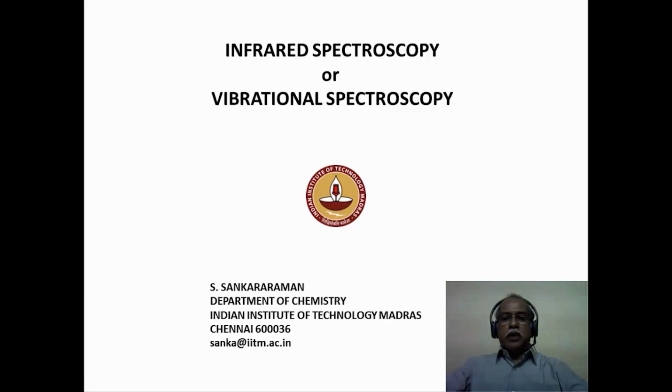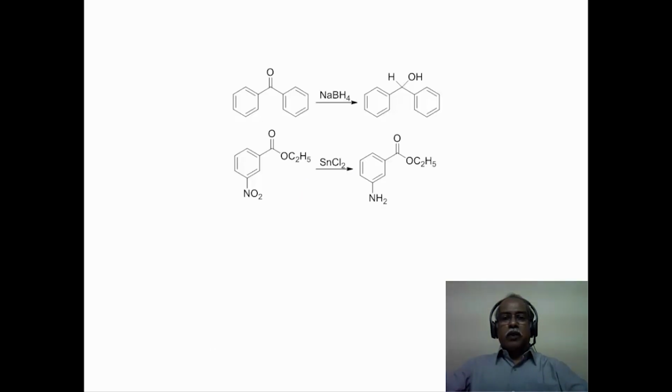Like any other spectroscopic method, infrared spectroscopy has its own special place in structure elucidation problems, and in the hands of organic chemists, it is a very powerful tool for identification of functional groups. Let us consider the following two reactions that are described in this slide.